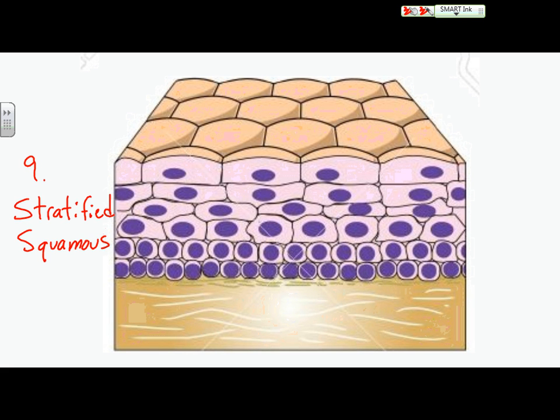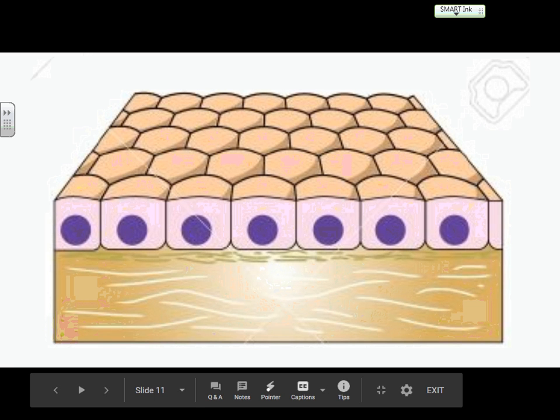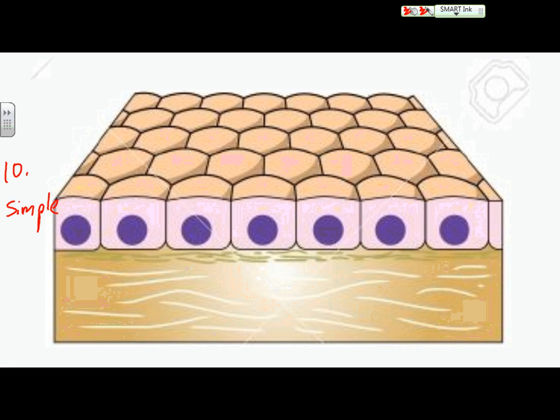Okay. Number 10. That's pretty easy. That's one layer, so that's simple. Look like cubes to me. Simple cuboidal. Okay.